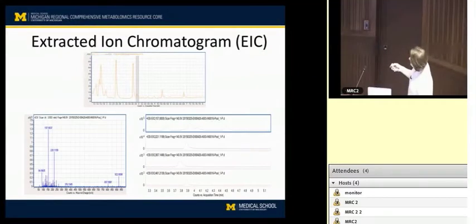They overlap obviously a little bit, or they wouldn't show up in the same mass spectrum. And then this one's a little bit earlier. And then these two look like they coelute pretty strongly. So that may mean something to us later on. We might want to see why are those two things coeluting so strongly, and if they have the same peak shape, does that mean that they're related ions? So we'll talk about that later.